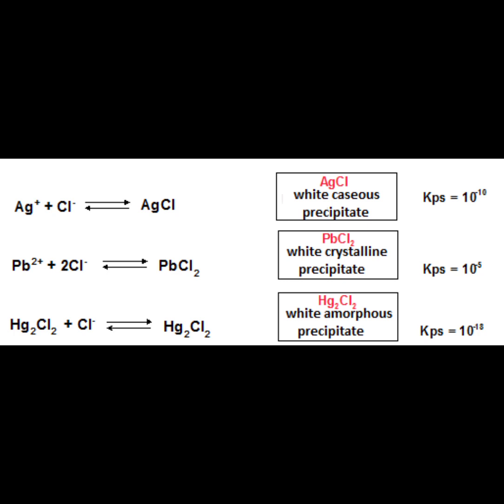Precipitation mechanism. How to precipitate chlorides of group 1 cations. The precipitation of these salts takes place because the abundant release of chloride ions Cl- from hydrochloric acid in solution allows the overcoming of their solubility product. We are obviously talking about the Ksp.